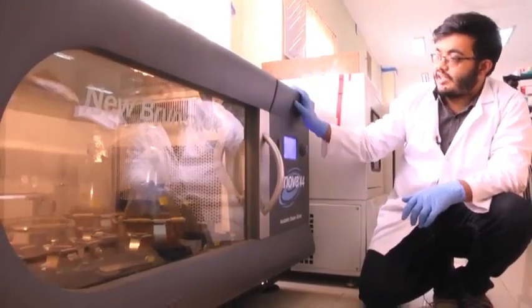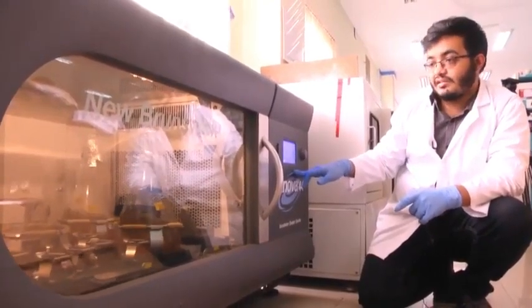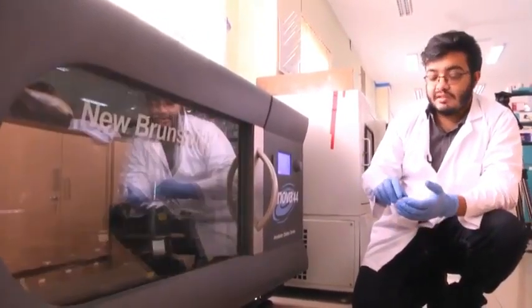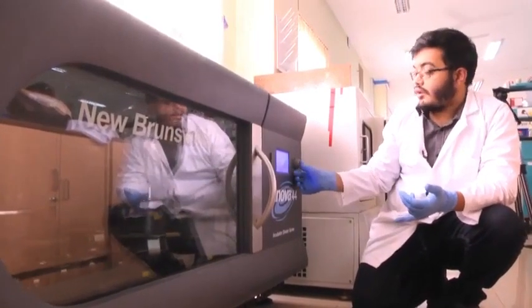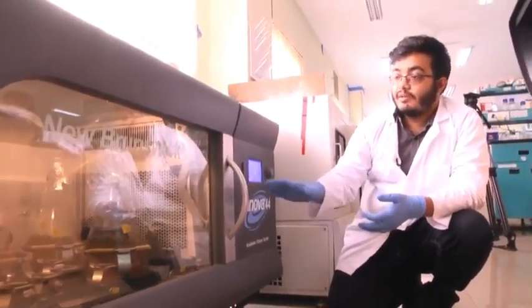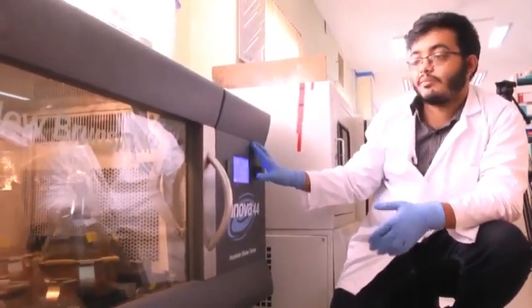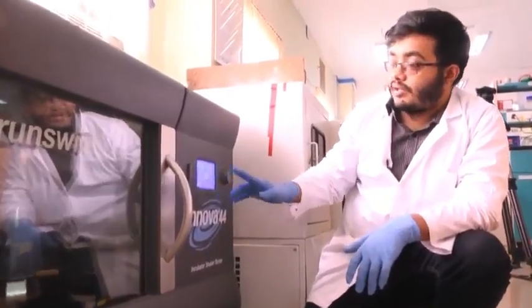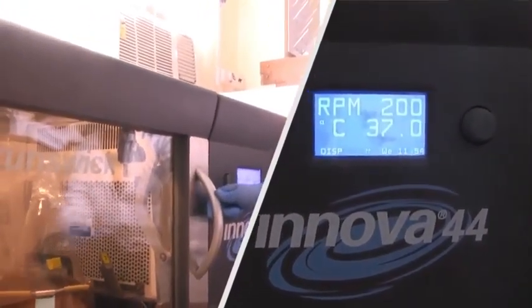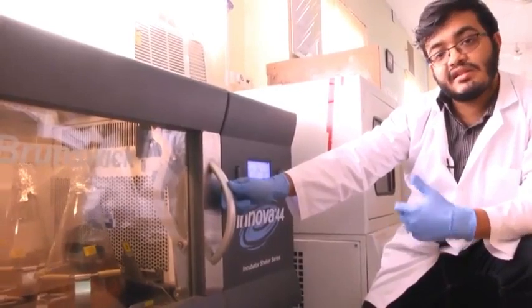Some of the salient features are, for now the bacteria that we are growing today is at 37 degrees, but in many instances scientists need to grow bacteria at a lower temperature in case the protein that we need to express is toxic, or in case the protein that is being expressed is not properly soluble. For such instances, bacteria needs to be grown at maybe 16 degrees or 25 degrees, and those temperatures can also be set and maintained by this shaker incubator. And also the RPM, for now it is revolving at 200 revolutions per minute, but that can also be lowered or increased as per requirement. So you will be learning in detail about these experiments in the subsequent lectures.